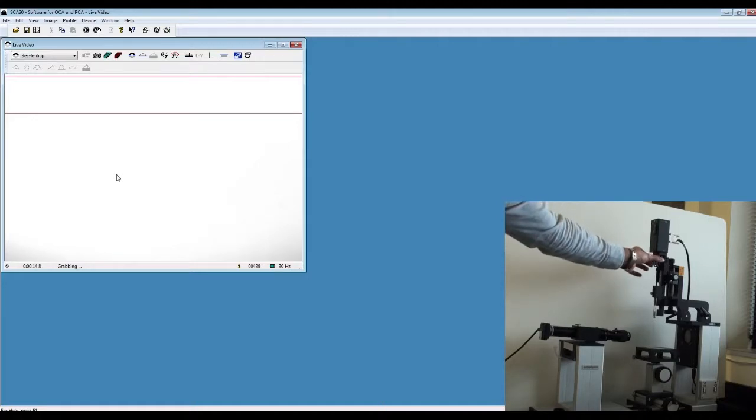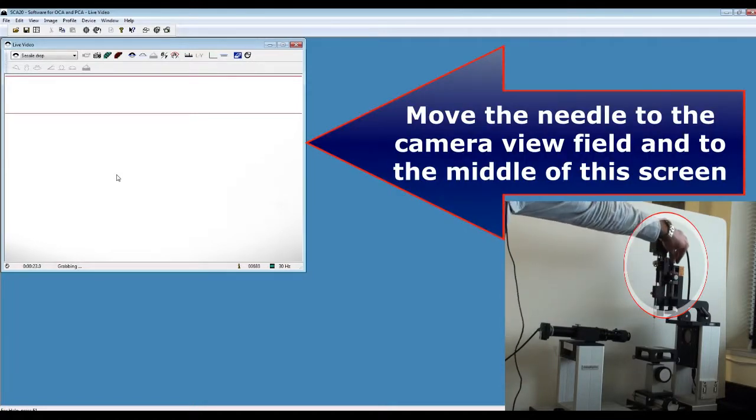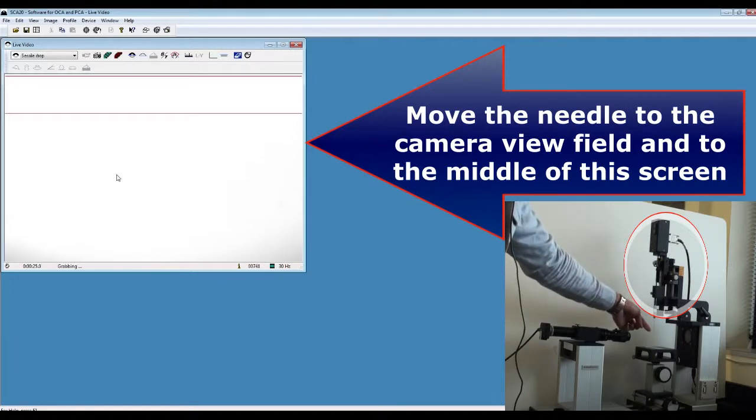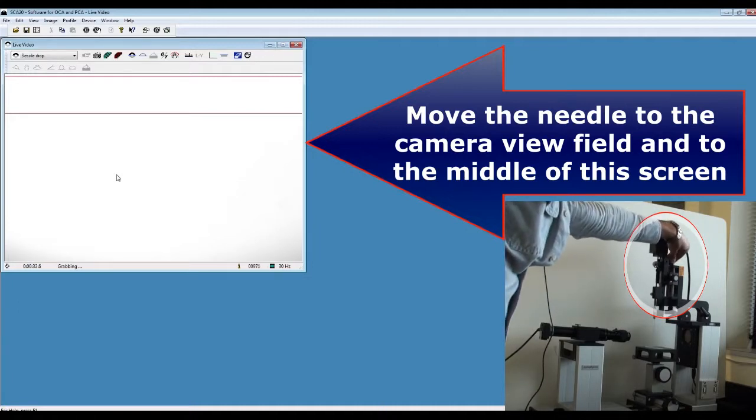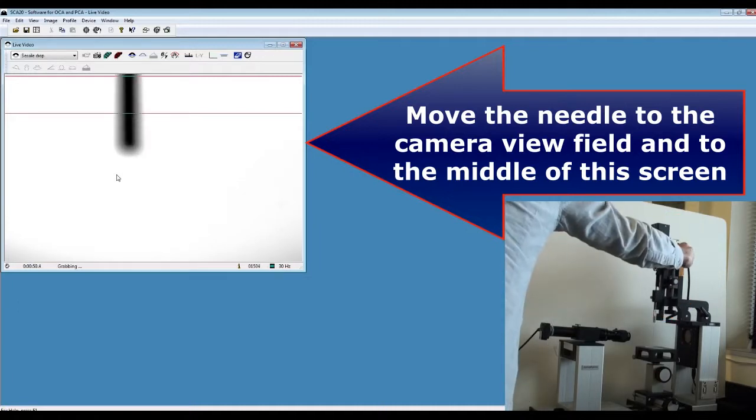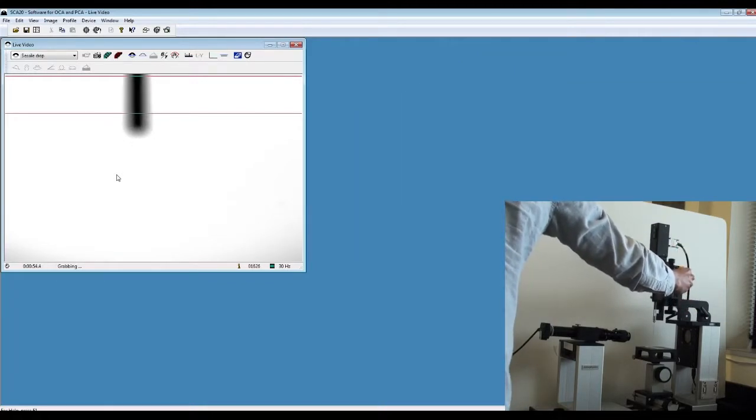Next, move the syringe holder unit down using the two designated knobs on top and on the right of the unit, so you can see the needle tip in your live view window on your software.